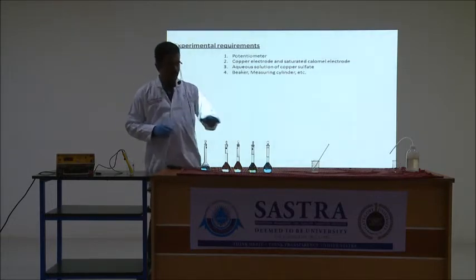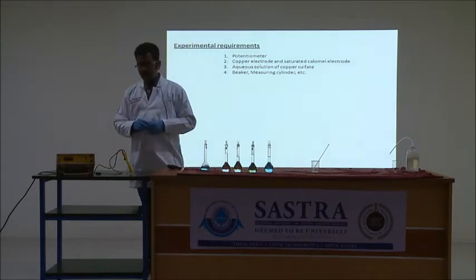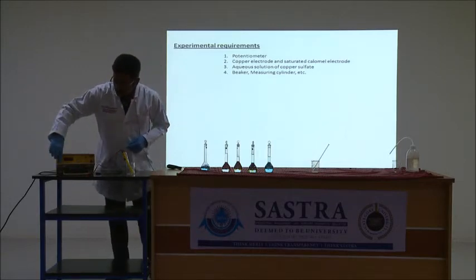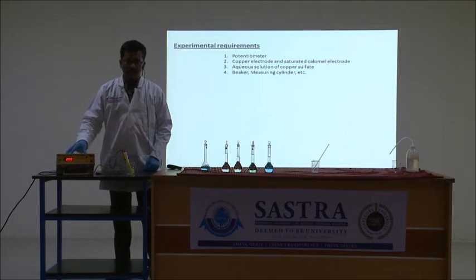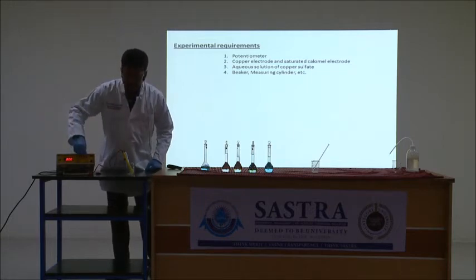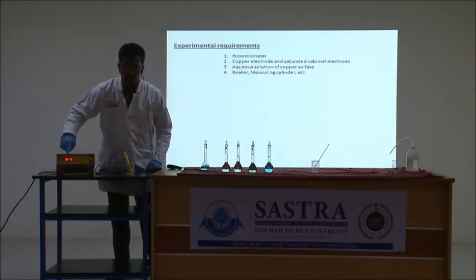Once these solutions are ready, there is also an unknown copper sulfate solution. Before beginning the experiment, switch on this instrument. This potentiometer has an input standard cell. To calibrate it, adjust this knob towards standard — it should show a value of 1.018 volts.